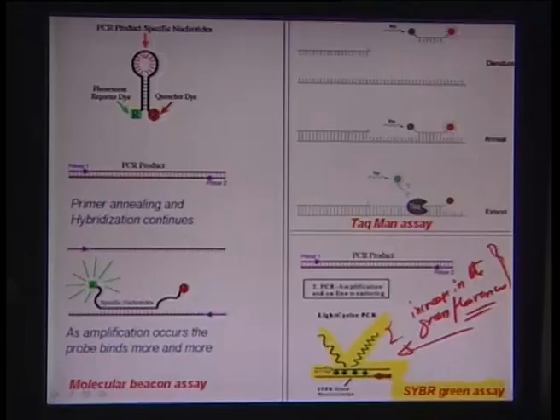However, the end recognition sequences do pick up the target DNA and amplify it many folds, let's say about 1 billion copies. And the success or failure of the SYBR Green based detection technique bases itself on the statistically significant number. If you're comparing 1 billion molecules to a few tens or few hundreds of molecules, it doesn't make sense to compare, because the signal from 1 billion molecules is going to be many folds over the trace amount of junk molecules which are available.